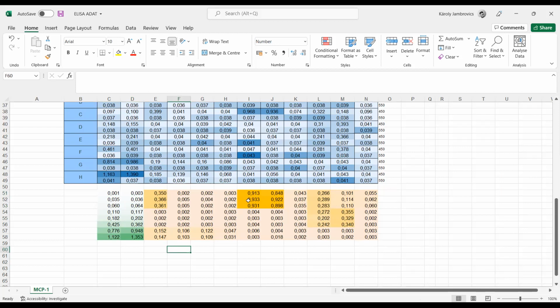the problem is that if you take the average here in the Excel file and then go further with GraphPad, then you need to change the type of the graph and the data sheet, like you already calculated the values here and here and here. So what I'm going to show you now is to subtract the blank one from the sample ones.